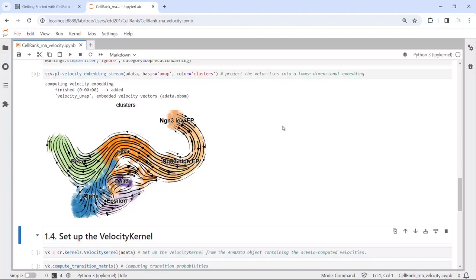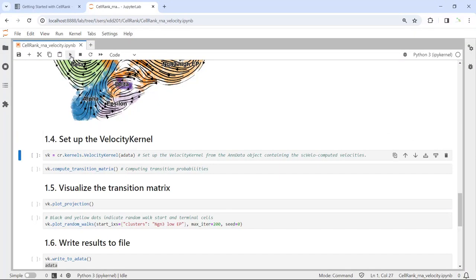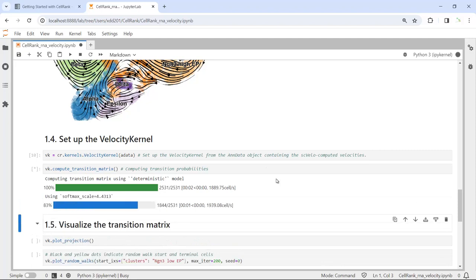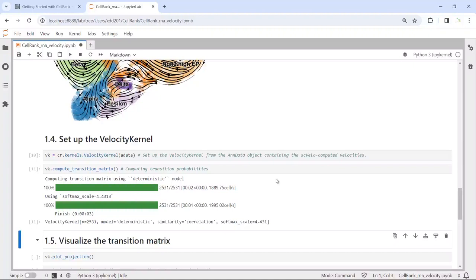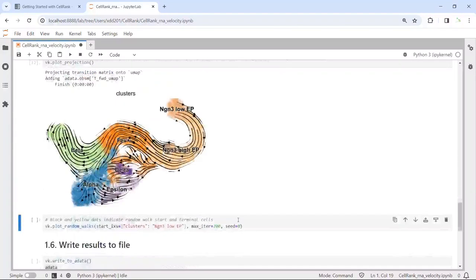Now we can set up the kernels for CellRank analysis. Because we are performing RNA velocity analysis, we set the kernel as the velocity kernel (VK). Then we can compute the transition matrix. For this demonstration dataset, it is very quick to compute the velocity transition matrix. We can visualize the transition matrix using the CellRank package by running the plot projection function. You can see it generated the same trajectory map as the scVelo embedding.